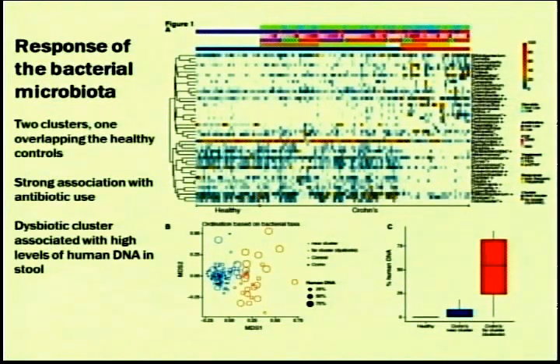Here's a whole bunch of metadata summarized up at the top. One thing we noticed early on, we meaning Eric Chen, who did all the analysis on this with Hongji Li, was you could cluster the samples into 2 different groups. So here's another kind of cluster analysis, akin to the UniFrac thing I showed, though not identical, where we can see separation into this blue group and this red group. And that's shown up here. The red group is here, and you can see the composition of bacteria is rather different, often associated with things like gamma proteobacteria, which are often baddies, and quite different from the healthies here, which are dominated by Bacteroidetes.